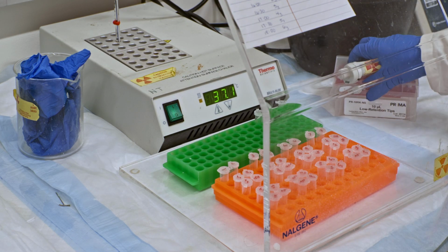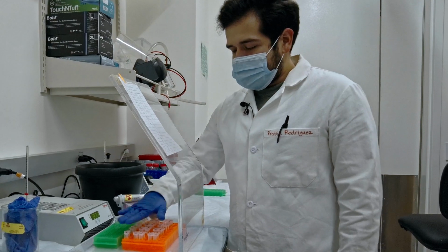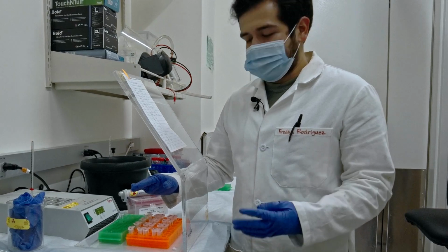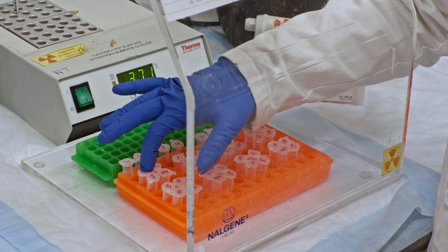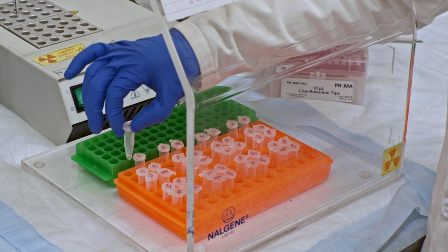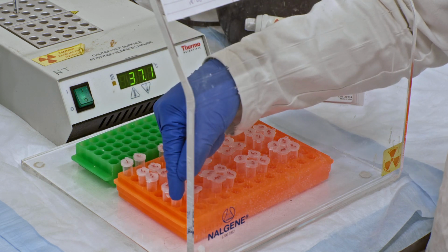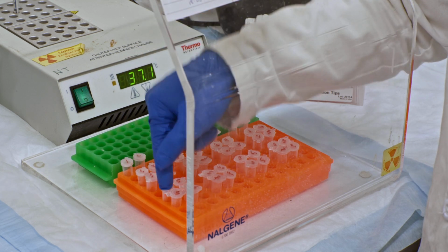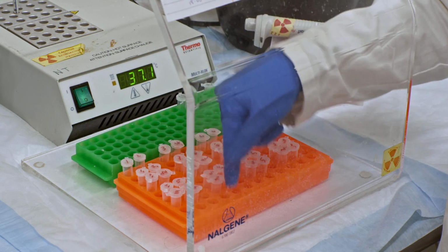A few things before we actually start to put things on the heat block, we should probably talk about the sample system that we have here. For these samples, I'm going to be taking different time points from 0 minutes, 5 minutes, 15, and 30. That's why, as you see here, for samples 1 through 8, I also have 4 respective samples for each reaction vessel. So for example, for reaction vessel 1, I have time point 1-1, 1-2, 1-3, and 1-4. In my mind, 1-1 is my time 0, 1-2 is my 5 minute, 1-3 is my 15 minute, and 1-4 is my 30 minute.